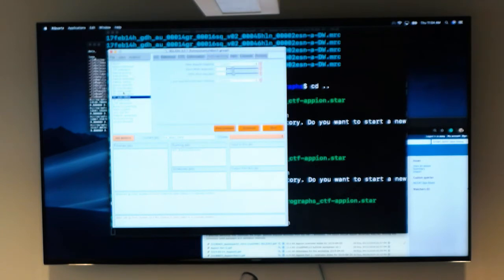And then for certain classification runs, you have the option in optimization to use fast subsets. You want to say yes, because what that will do is it'll use an initial subset, and then every iteration it'll bring in more and more particles. The advantage of that initial seed is fewer particles, therefore the beginning iterations will be faster. It's not using the full data set. There are times where you might want to use a full data set, but this particular data set is D3 symmetry, a good test sample, and you should be able to use fast subsets.